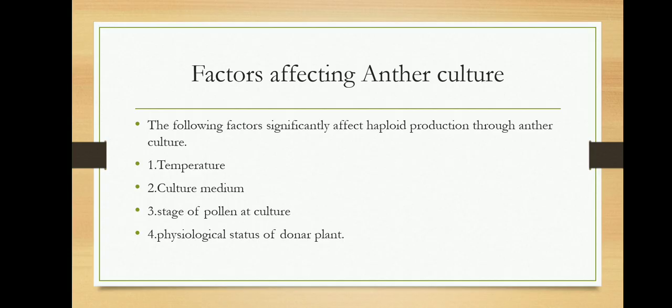In contrast, only 21% of anthers yielded embryos if the buds were maintained at 22 degrees Celsius for the same period. Means here the scientist Nitsch proved that the cold treatment in the case of Nicotiana tabacum will promote the formation of embryos in 72 hours.